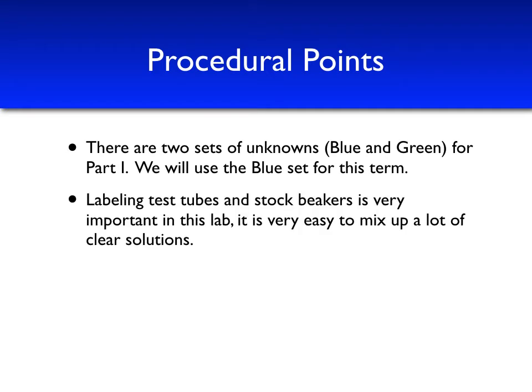You also see that labeling is a very important part of this experiment. Since we're working with many different clear solutions, we want to make sure that we properly label our stock beakers and in some cases test tubes to make sure that we are able to very clearly identify things and that nothing is mixed up.